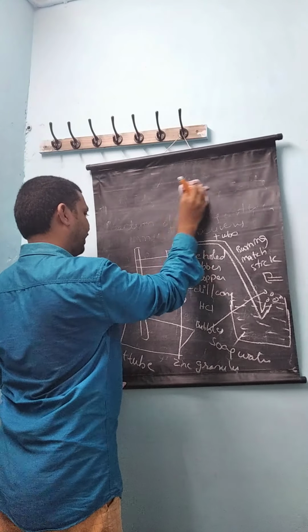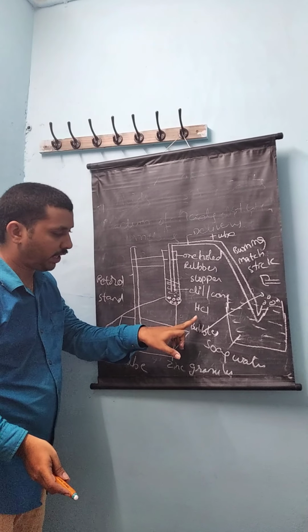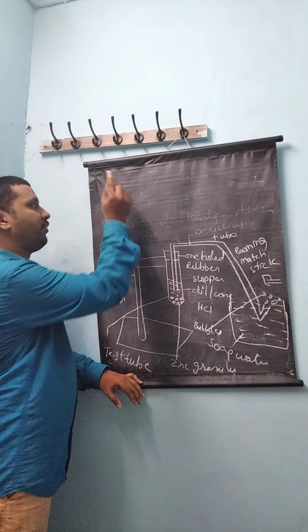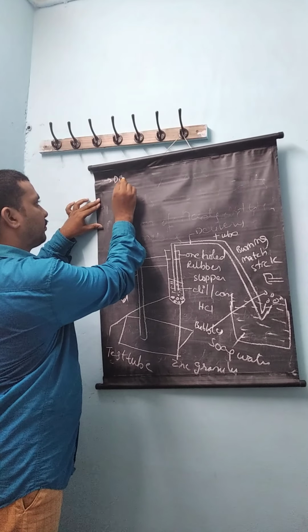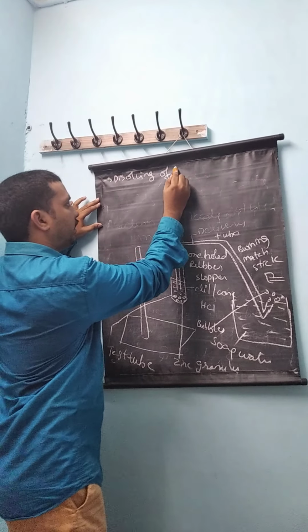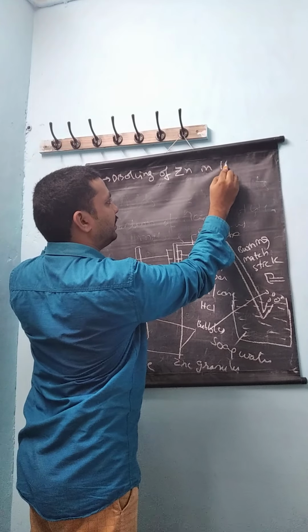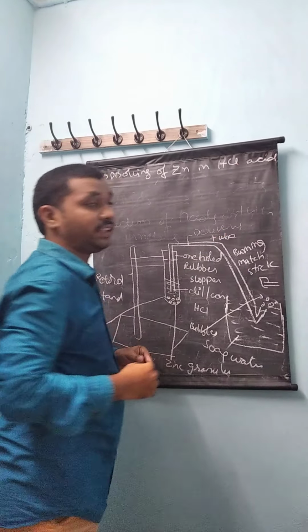In the activity, the reaction between hydrochloric acid and zinc granules has taken place, and we observe the slow dissolving of zinc in HCl acid.